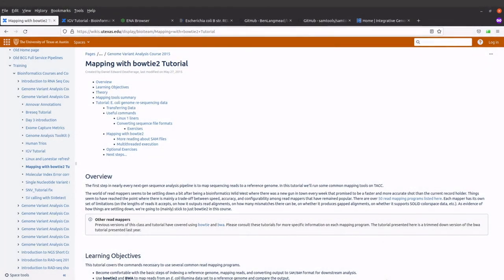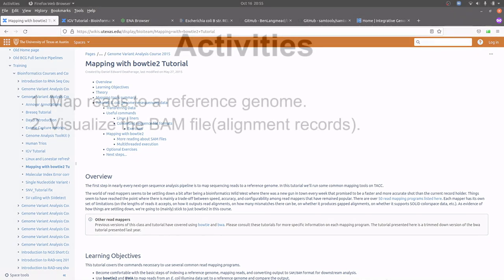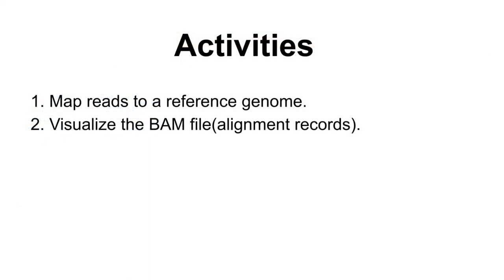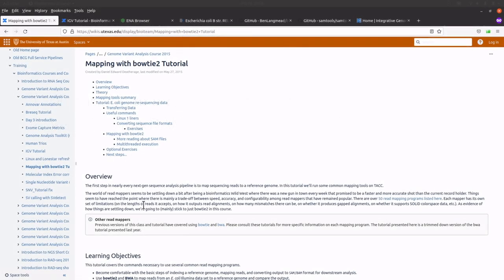In today's video I'm going to show you how to perform genome mapping using bowtie2. We are going to map reads to a reference genome and after that we are going to visualize the mapped data. This video was made using a tutorial from the UT Texas website. I saw it last week and said this tutorial is cool and easy to reproduce, so I'll do that for viewers to learn.